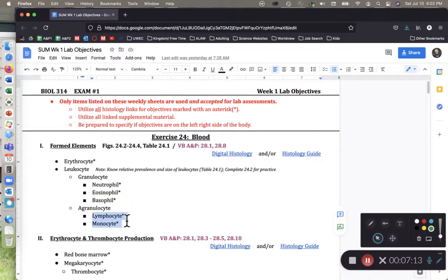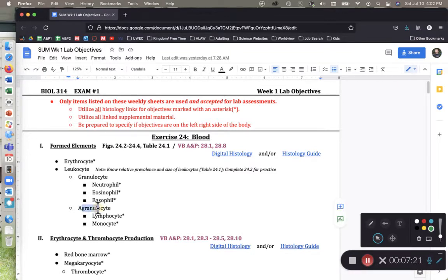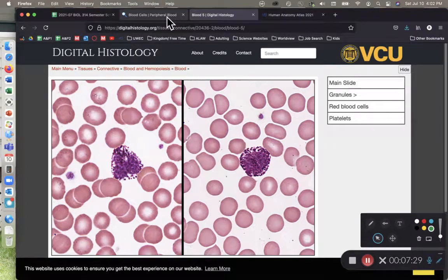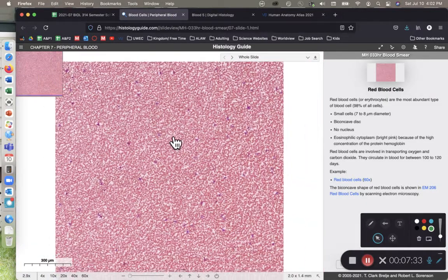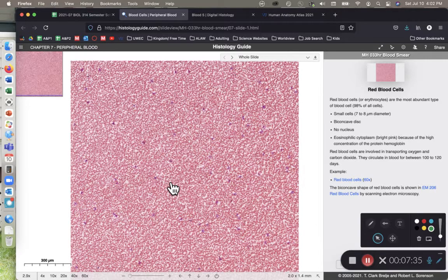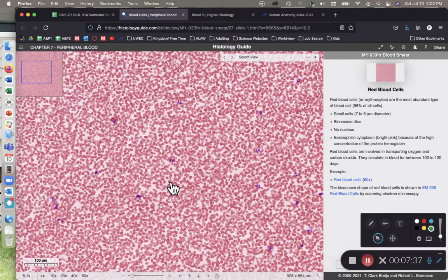Up next, we have the agranulocytes. 'A-' meaning without, 'granule' meaning granule, and '-cyte' is a suffix that means cell. We have the lymphocyte and the monocyte. I'm going to go ahead and use the histology guide site, as it's a little bit more difficult for students to navigate.